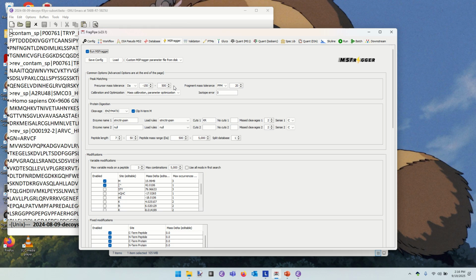If you felt that the sample was really dominated by just a few proteins, like you were dealing with serum or plasma or something, then you might choose to do semi-tryptic searching here. It would actually help you out a lot. But semi-tryptic in combination with open search is quite a heavy burden. So here we're going to just do the open search and act like everything is a very well-behaved tryptic peptide.